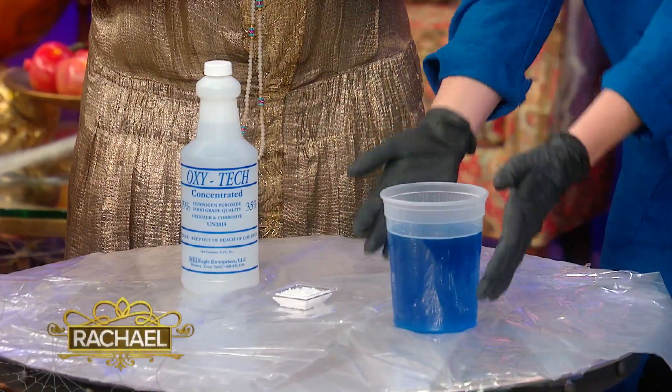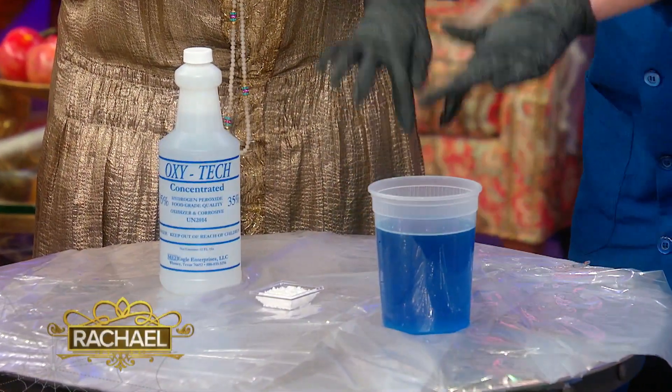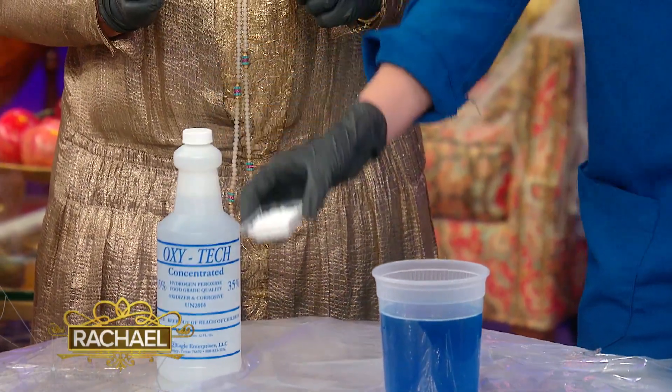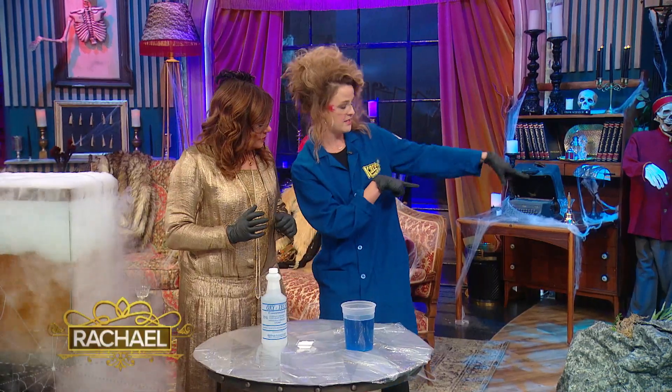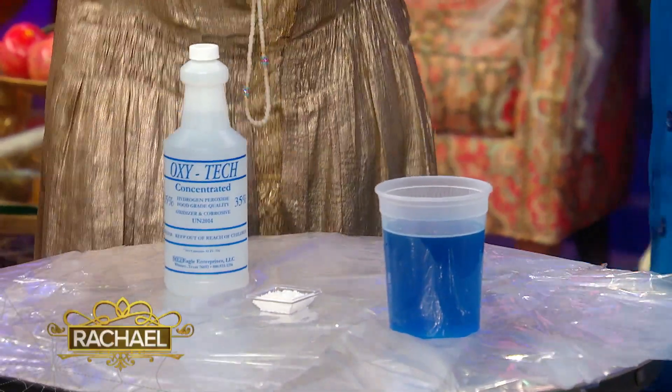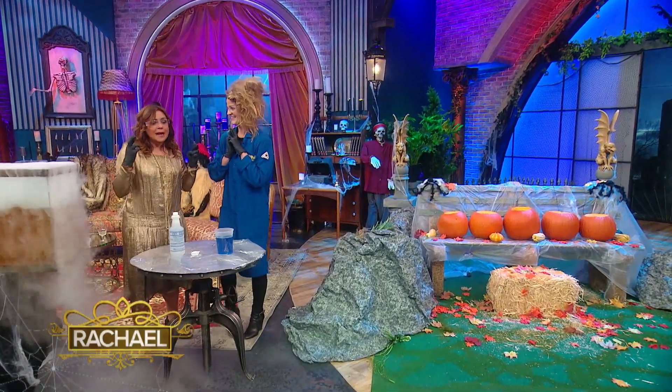What I have here is a container with some 35% hydrogen peroxide and dish soap. And then in this little container over here, I have solid potassium iodide. What we're gonna do in the pumpkins is dump the catalyst into the solution and hopefully, fingers crossed, we'll see a reaction. Let's go make something happen.